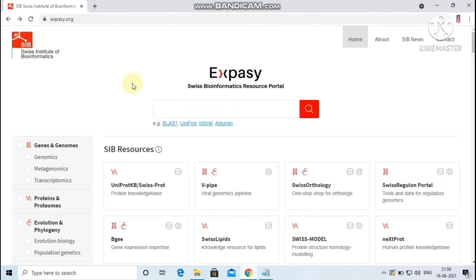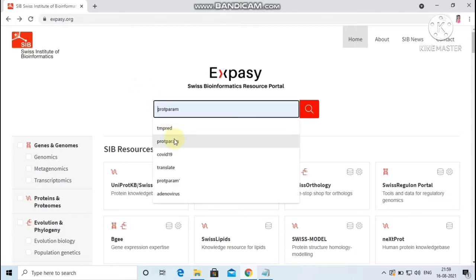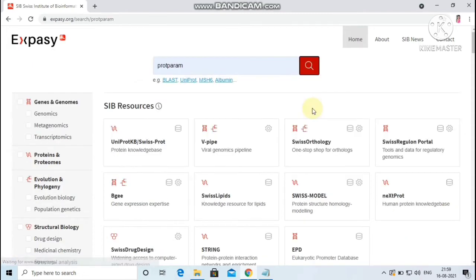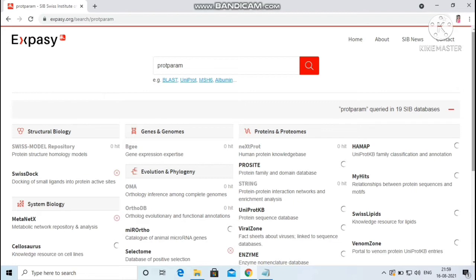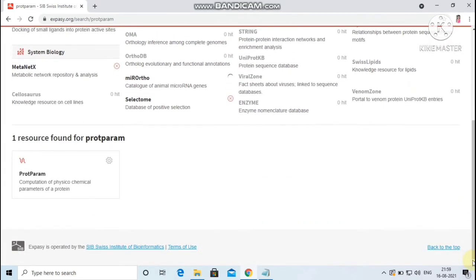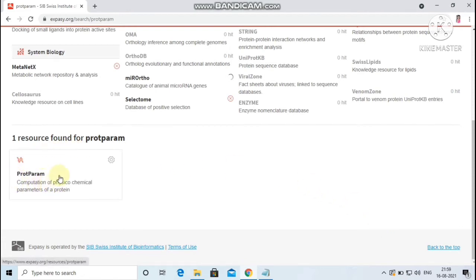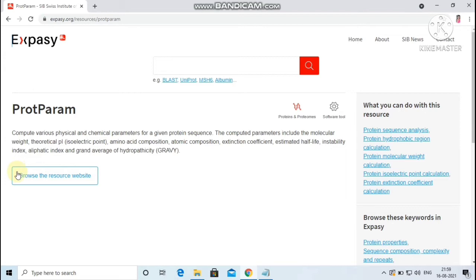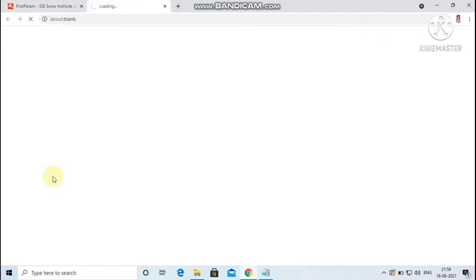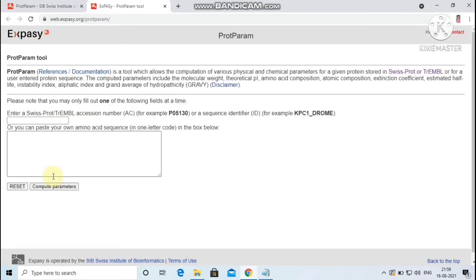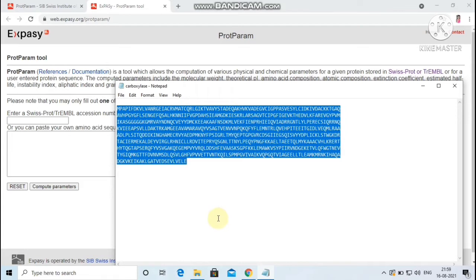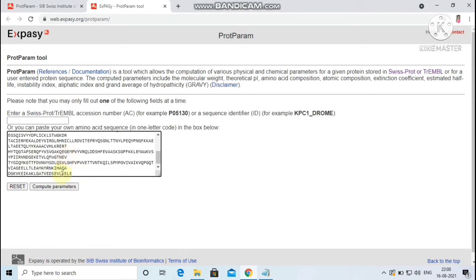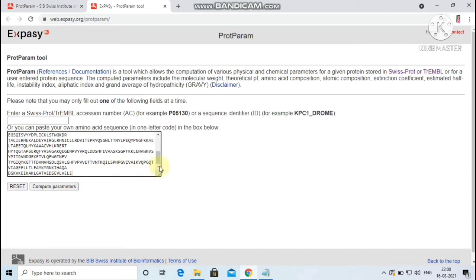Let me give demo on the tool ProtParam. The tool can be accessed by using the keyword ProtParam in the resource portal ExPASy, or it can be directly accessed through your web browser using the same keyword. The resultant page provides the resources related to the keyword ProtParam. Click on the resource. You will see the hyperlink Browse the resource website. Click on it. You will be directed to the page where you can provide your input sequence. The protein can be either specified as a SwissProt or TrEMBL accession number or ID, or in a form of raw sequence. Here I am going to compute the physicochemical properties of the enzyme carboxylase from the organism Leishmania donovani. Click on the compute parameters.